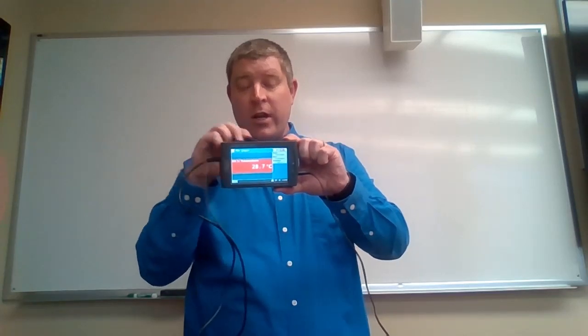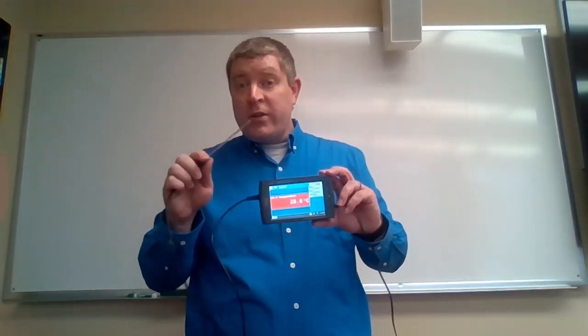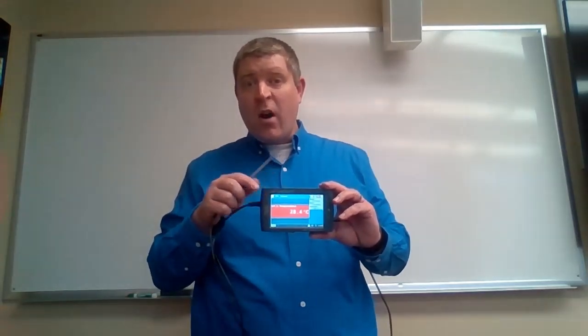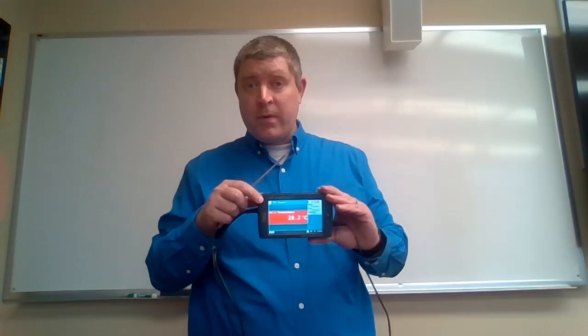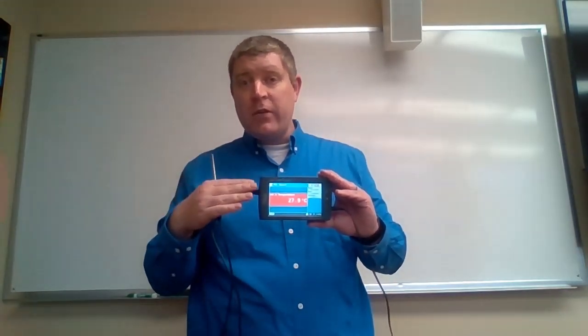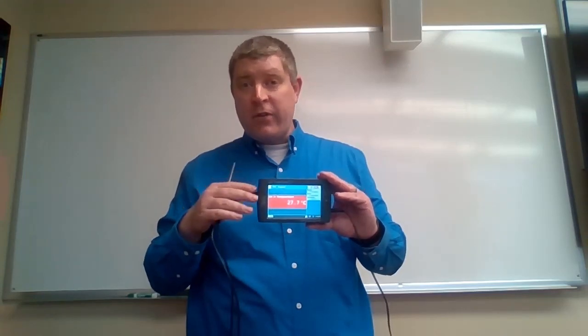So if I grab it, you should be able to see the temperature changing on the LabQuest. The LabQuest then measures the voltage in that temperature probe. Now, that voltage change is relatively small for small temperature changes around room temperature. And this means that there tends to be a fairly significant noise on top of that signal.